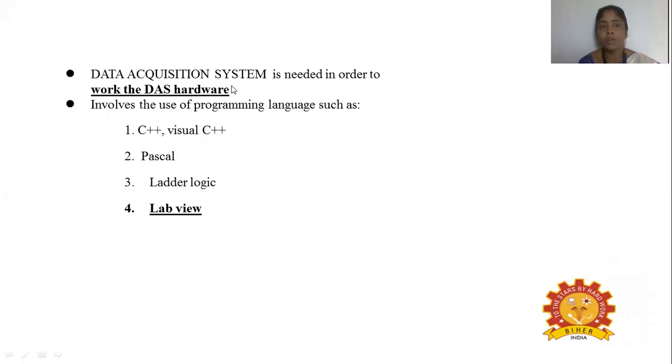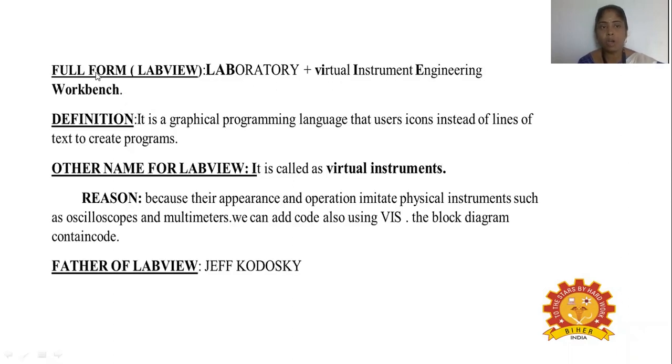Here we need to monitor what is in your data acquisition system. You need to work with the DAS hardware, which uses high-end languages like Visual C++, C++ and Pascal. LabVIEW is said to be the Laboratory Virtual Instrument Engineering Workbench, which has been utilized at laboratory scale for product formation, optimized by utilizing the substrate. In simple language, it is a graphical programming language that uses icons instead of lines to create programs.